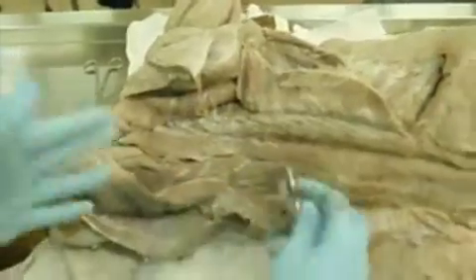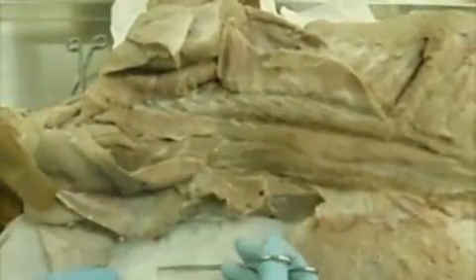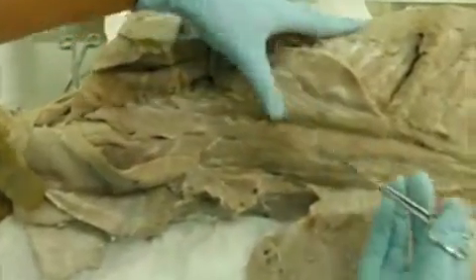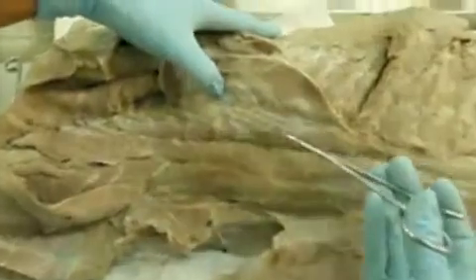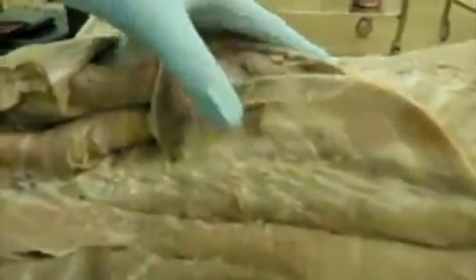So technically, it really has just 2 parts that we can see, but there's 3. The way you remember it, it's unique because it has these little shiny tendons. And when you see that, you always know that's your iliocostalis thoracis.